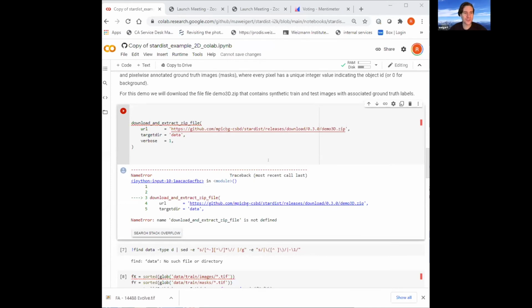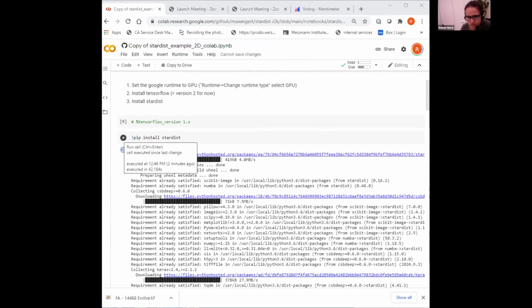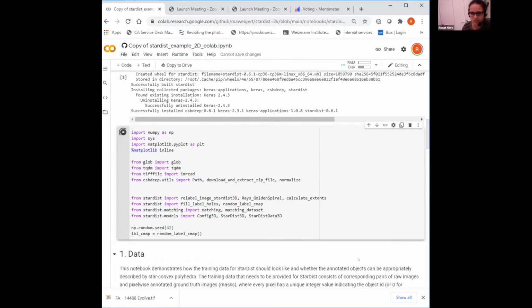Oh, you have to run the first code cell where we import everything. So just download and extract. Yeah, so you did the pip install exactly. Yeah, I did. And if you go to the next one, no, don't redo that. Exactly this one. No, below. If you go down. Exactly this one. Okay, because this imports this function. Yes. That's why in notebooks every code cell has to be run in succession, and it should hopefully download now. Okay, thanks. Sure.